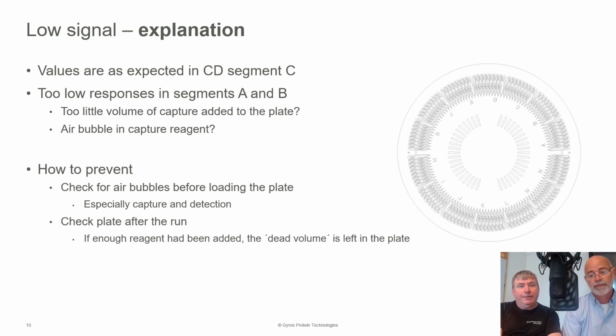If you put anything less than that in there, you might see that you've not added enough. I like to add more. Yeah. If it says 7 microliters, I like to do at least 10. If it says 20, I like at least 25. And certainly that's useful if you have that extra volume.